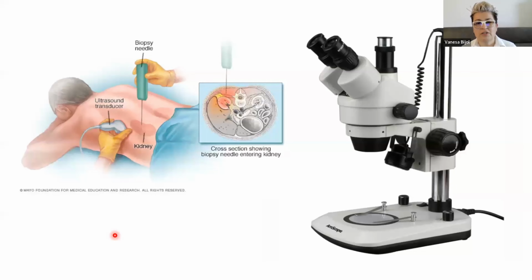And I actually used to have it in my car. And when I would go to procedures off site, I would just pull it out of my car, and you actually can see the specimen really well because you have what is called a stereo microscope. You don't have a stage here, but you have a space where you can manipulate your specimen, and you can actually see the texture of the tissue core that you're given.